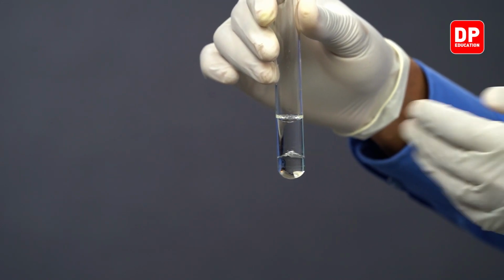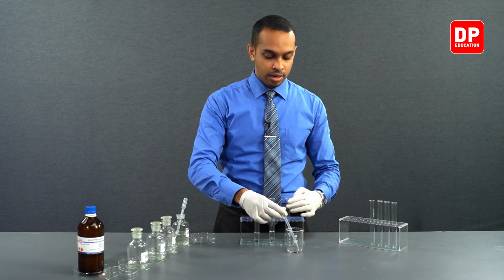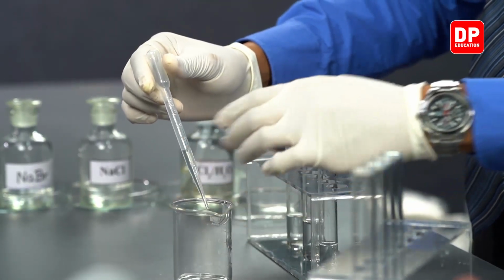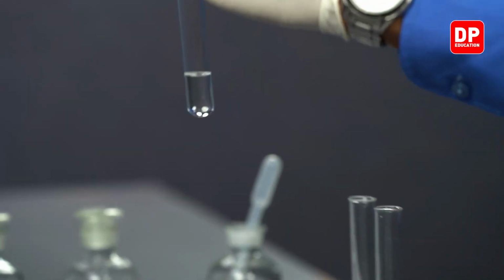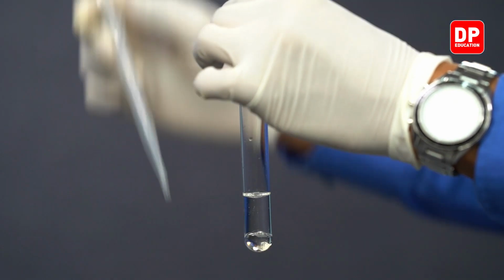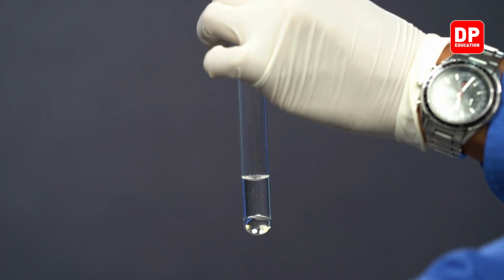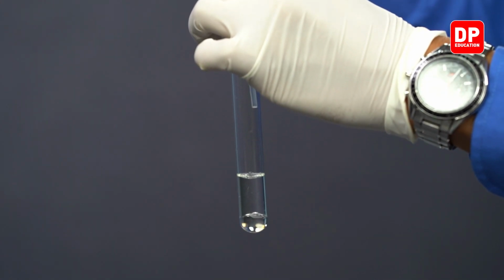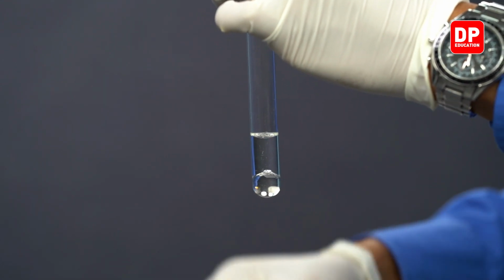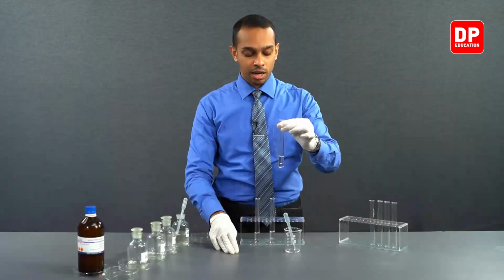sinks to the bottom because all of these are aqueous solutions. So when you add carbon tetrachloride to any aqueous solution, we expect it to sink to the bottom because carbon tetrachloride is denser than water. Now what I'm holding right now is our potassium iodide aqueous solution, and onto that I have added a little bit of the organic solvent, which is carbon tetrachloride.